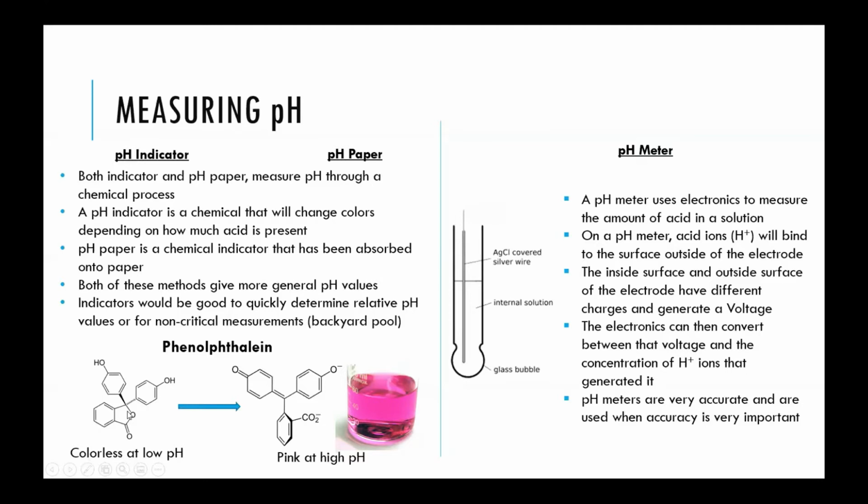However, if the pH increases and the solution becomes basic, that equilibrium change between H+ and the indicator itself causes this reaction. So the equilibrium would be this version in equilibrium with this version, the pink version, plus H+.